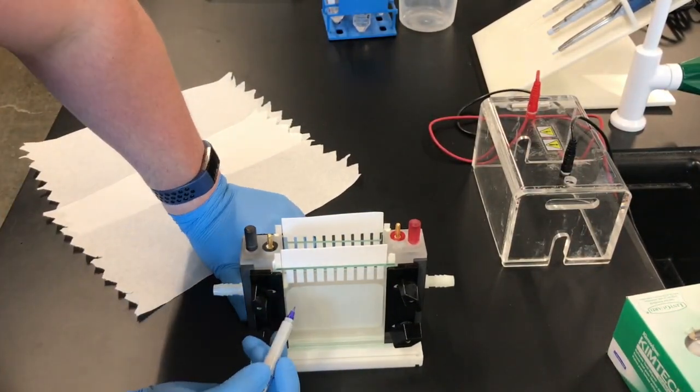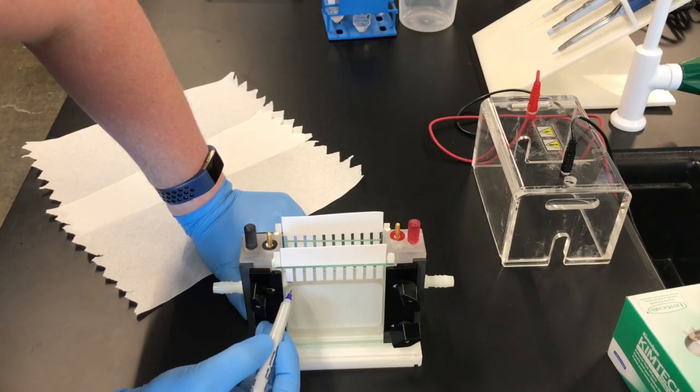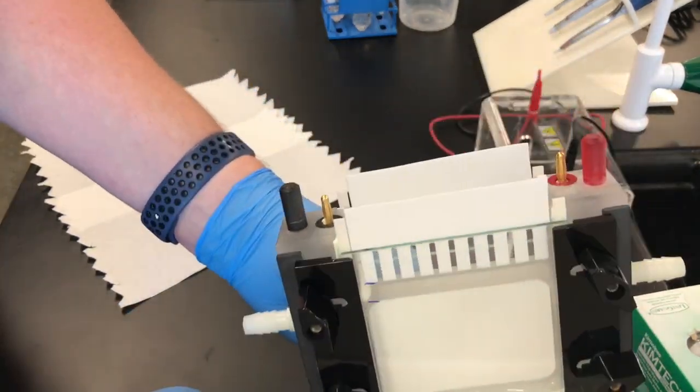Once the combs are in, use a marker to mark the bottom of one of the wells as well as another mark about an inch or so below it.